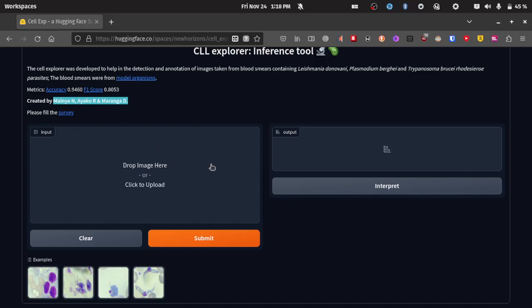I'll not say representation so much, but it'll grab the pixel values that are representative of the image, and then you pass it through another formula, which will tell you the likelihood that this image contains a certain label.